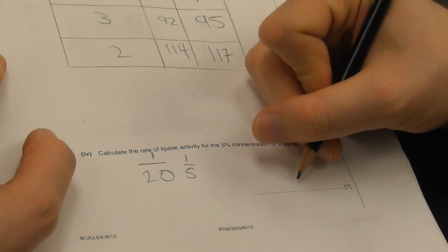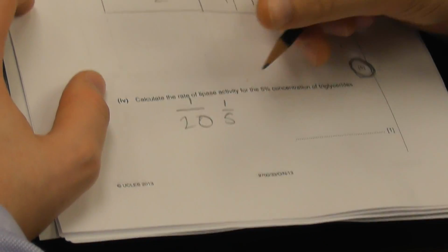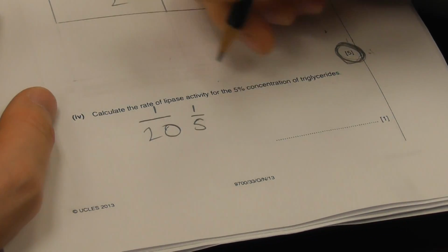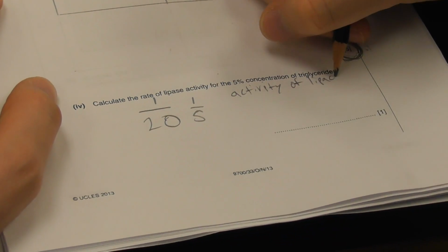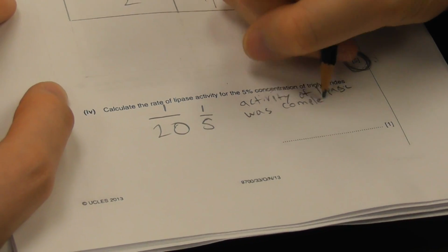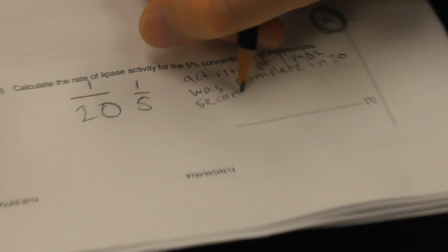Ta-da! So if we do the math on that, the activity of lipase is it was complete in 20 seconds.